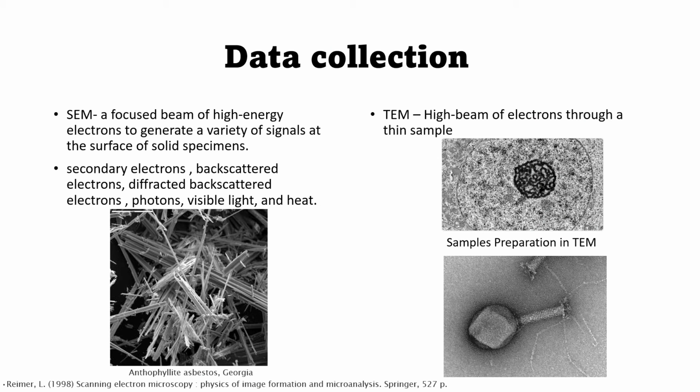And finally, we have come to the end of the presentation with data collection, how we actually take everything we've learned and apply these methods to gain some sort of data. So as you can see here, we have our two different examples of electron microscopy. We have the TEM and the SEM. We'll look at the SEM first.